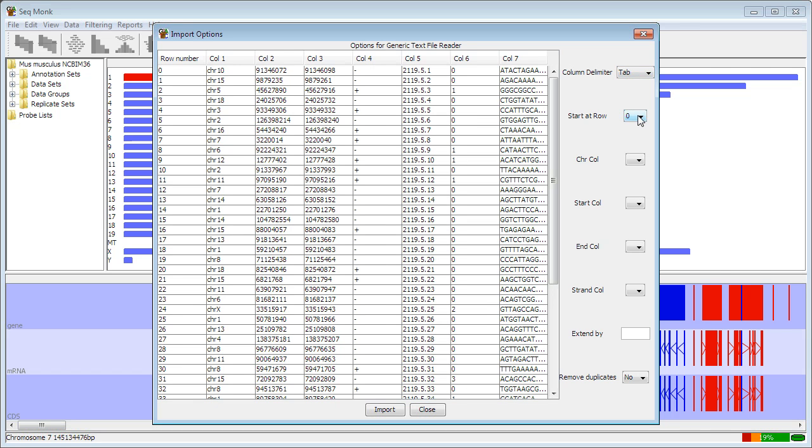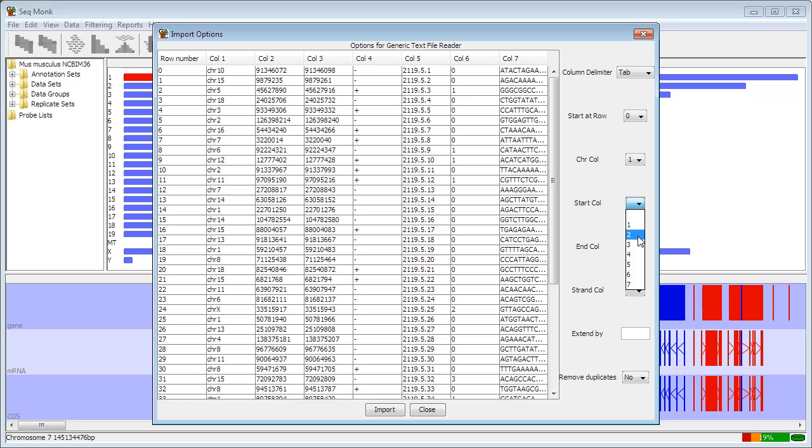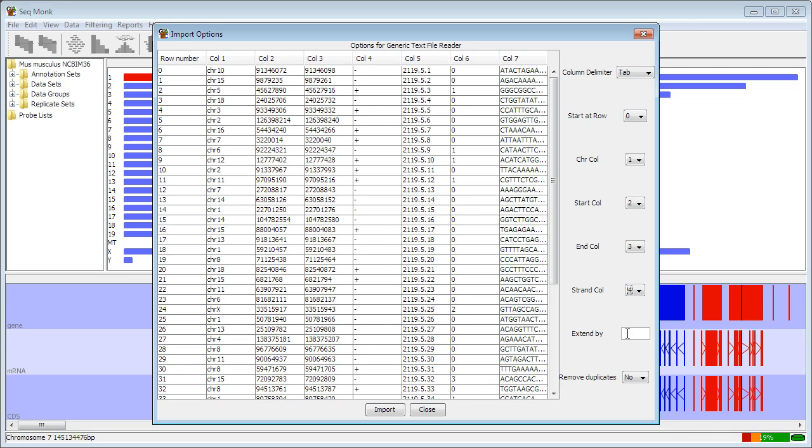The second one allows me to exclude any header at the top. In this case I don't have a header so I don't need to. And then the next columns ask where particular pieces of information are located. So my chromosome information is in column one, my start is in column two, my end is in column three, and that's all I actually need to supply. But I also have strand information here which is in column four.